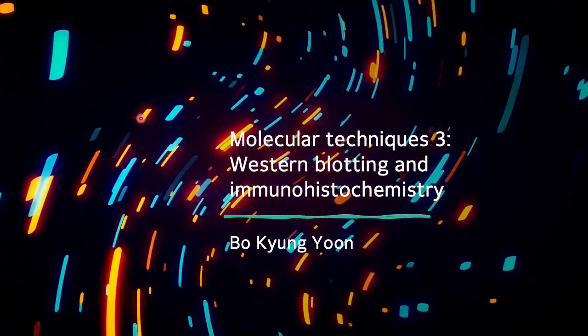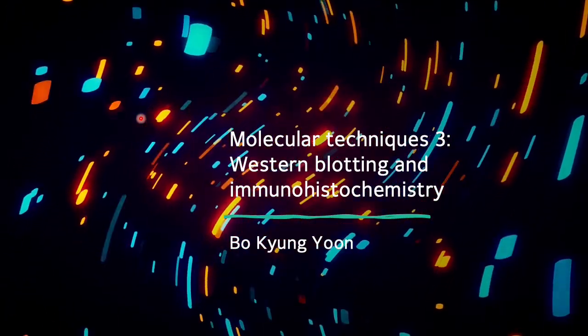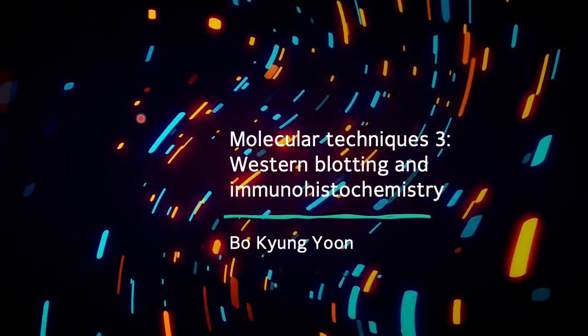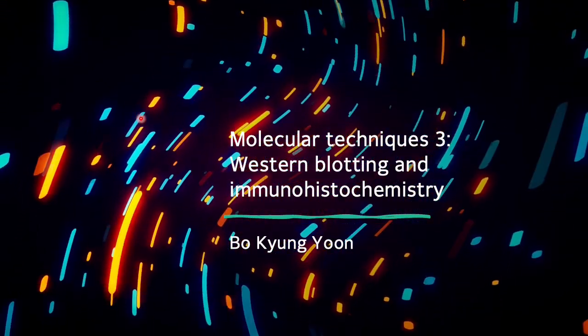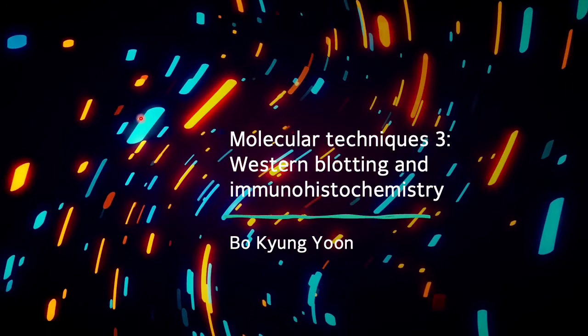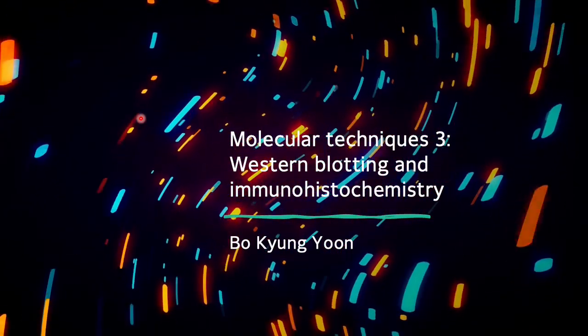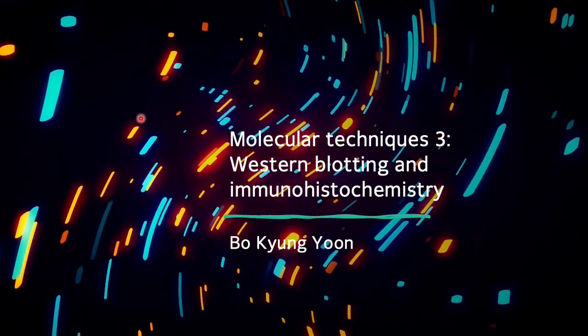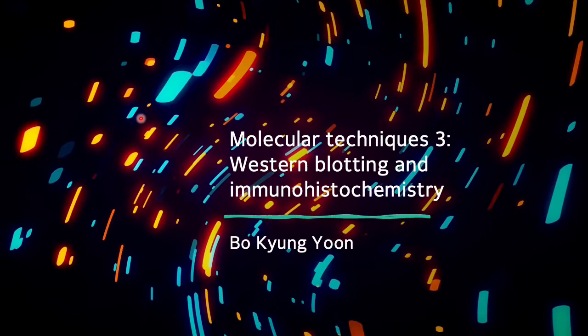This is my third and last lecture, and today I'm going to talk about molecular techniques, which are Western blotting and immunohistochemistry. To start with, Western blotting and immunohistochemistry is all about seeing proteins. It's about proteins, and we call it protein work.